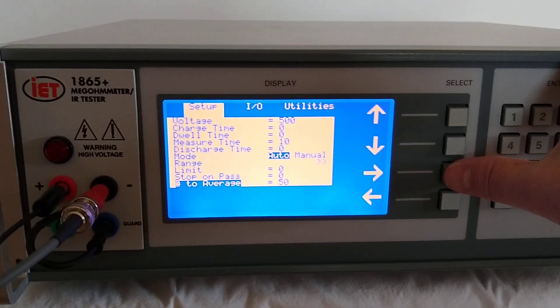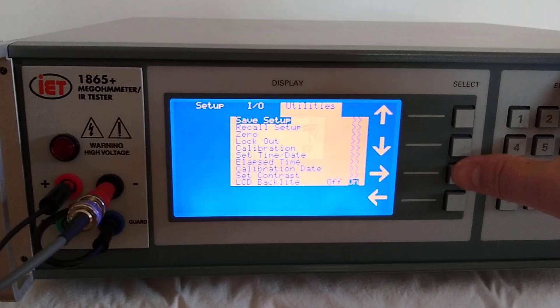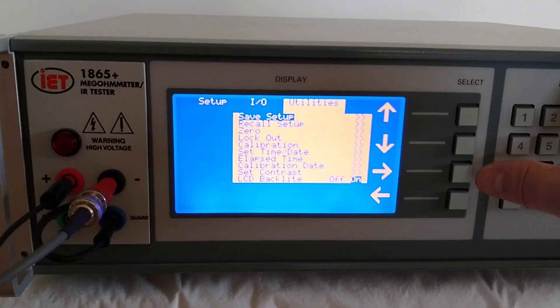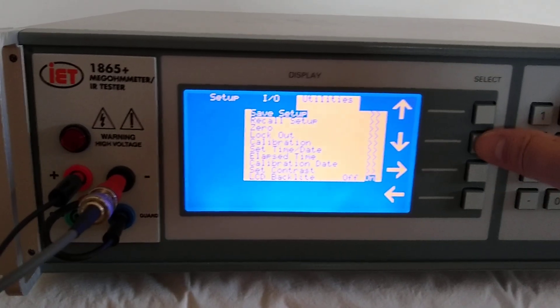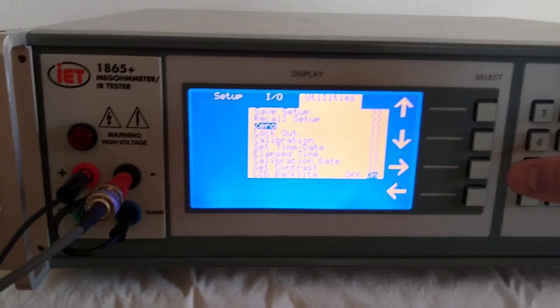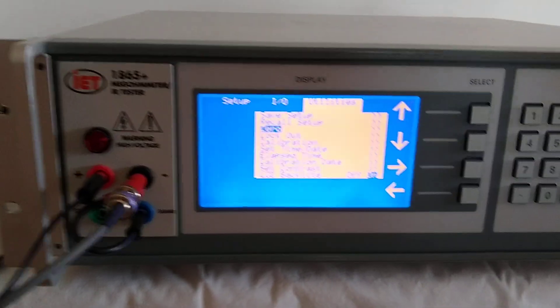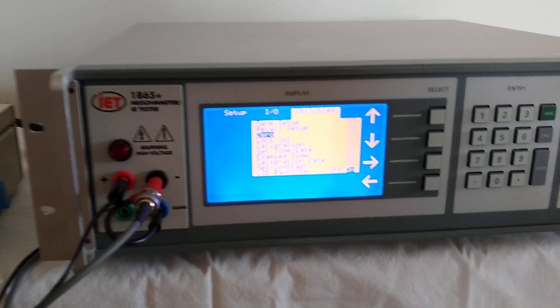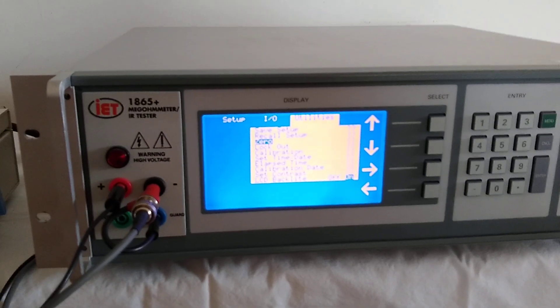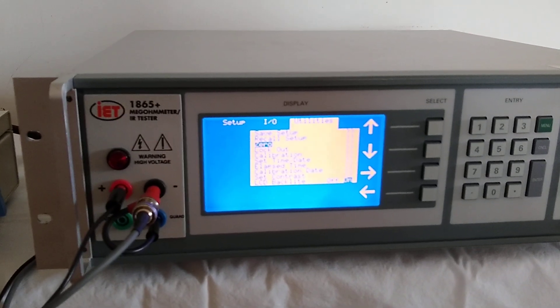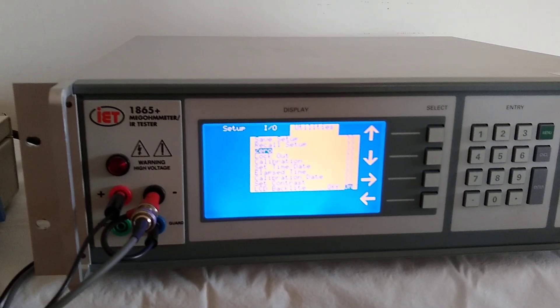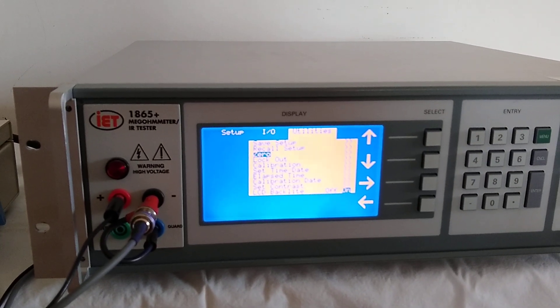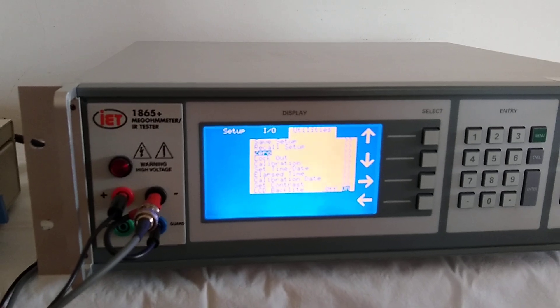We can also use the select to go over to utilities. When we go to utilities, we can do what we call a zero, which basically zeroes out any leakage that might be associated with the cables or the 1865-11 volume resistivity cell.